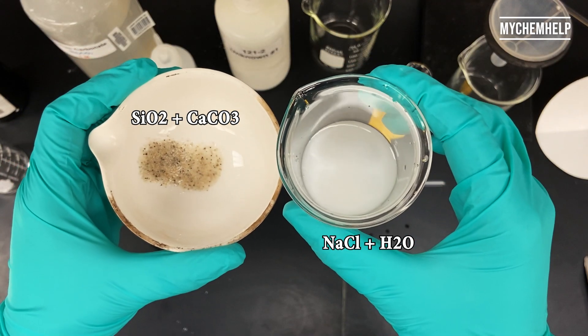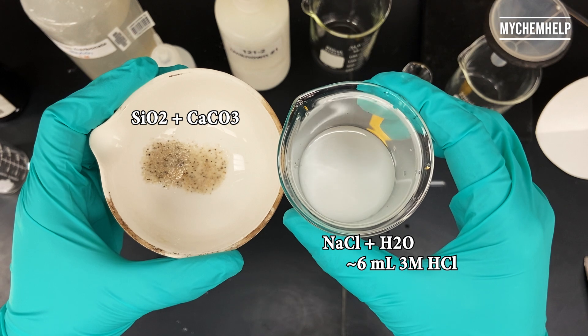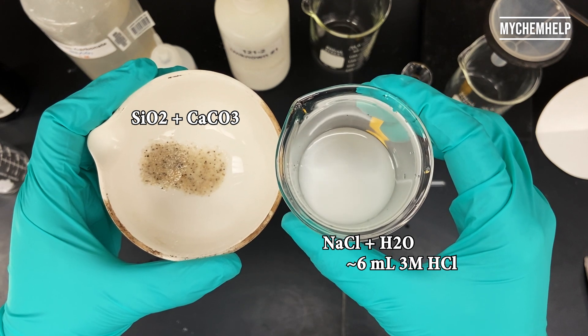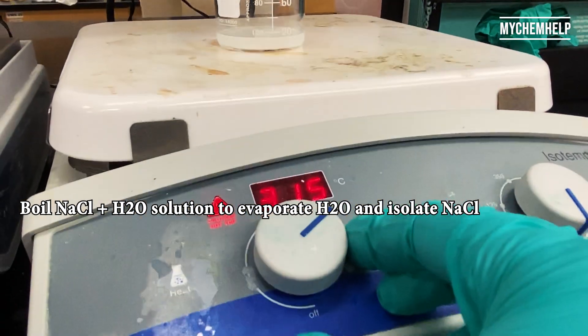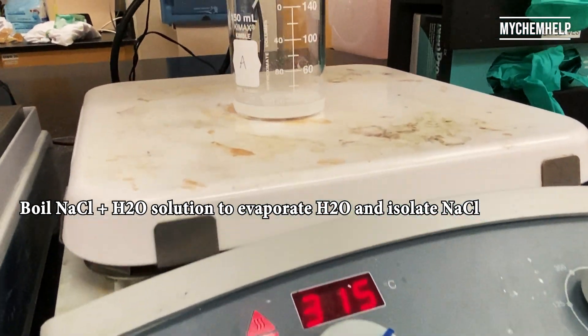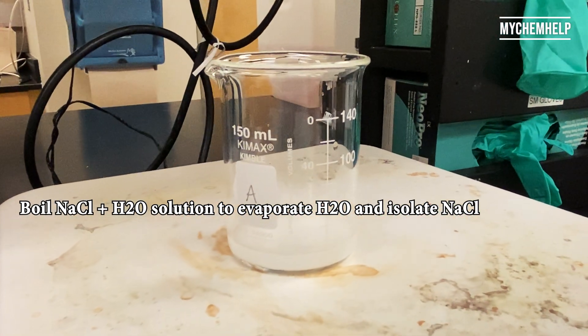Okay, and so what's left in the evaporating dish is silicon dioxide and calcium carbonate, and then we have the aqueous sodium chloride solution in the beaker. Now time to boil that and evaporate the water and isolate the sodium chloride.